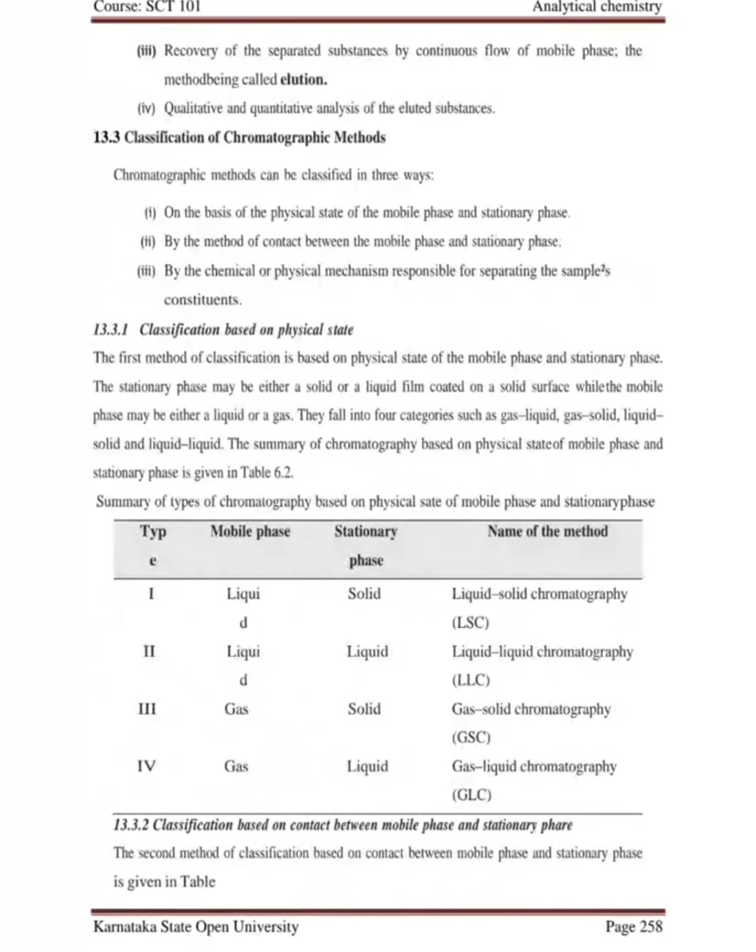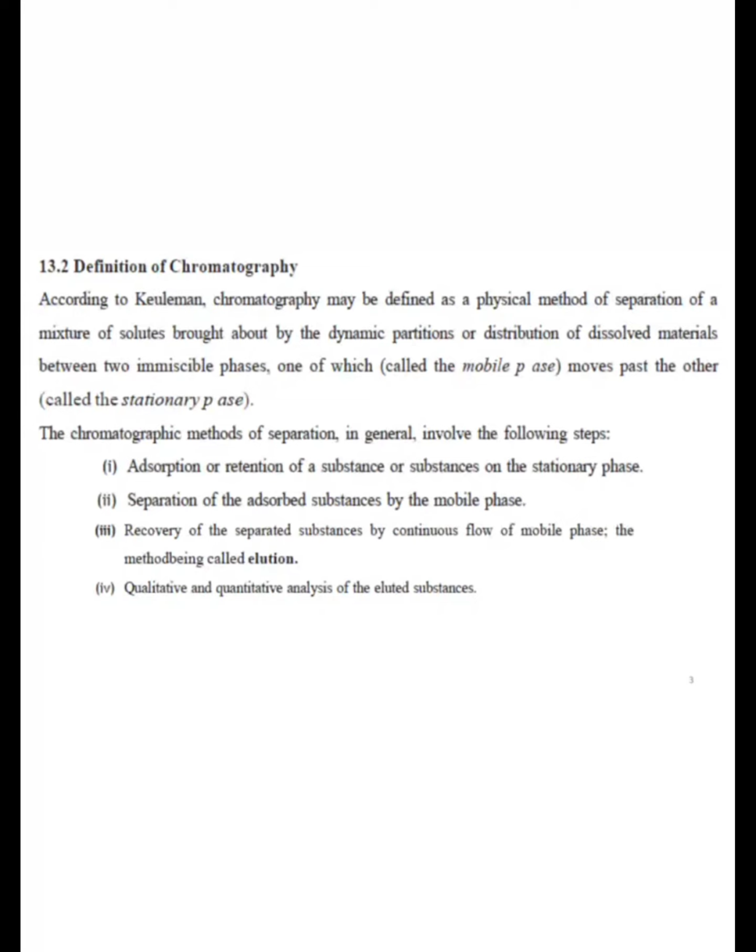Wait a second, I have made one slide, I will show you that. Yes, in this, the first step is adsorption or retention of the substance.